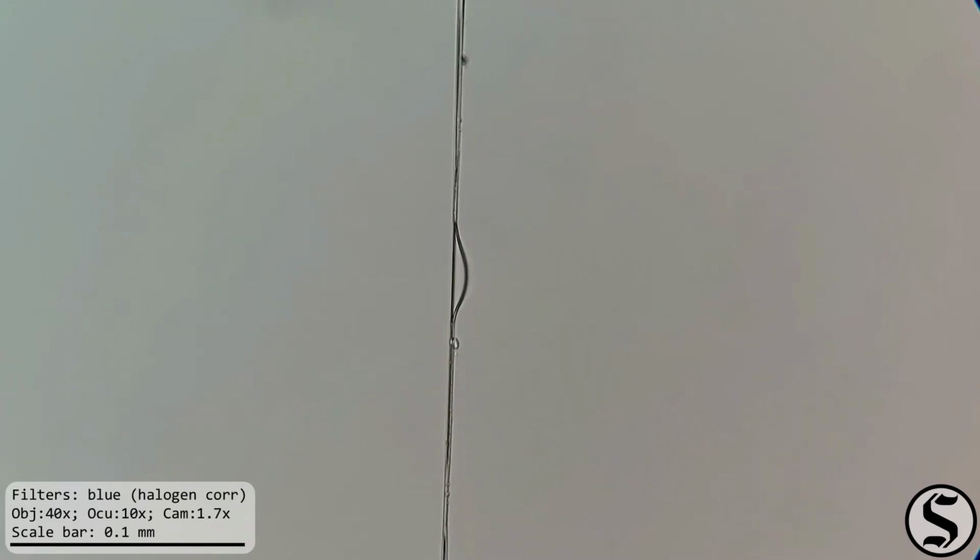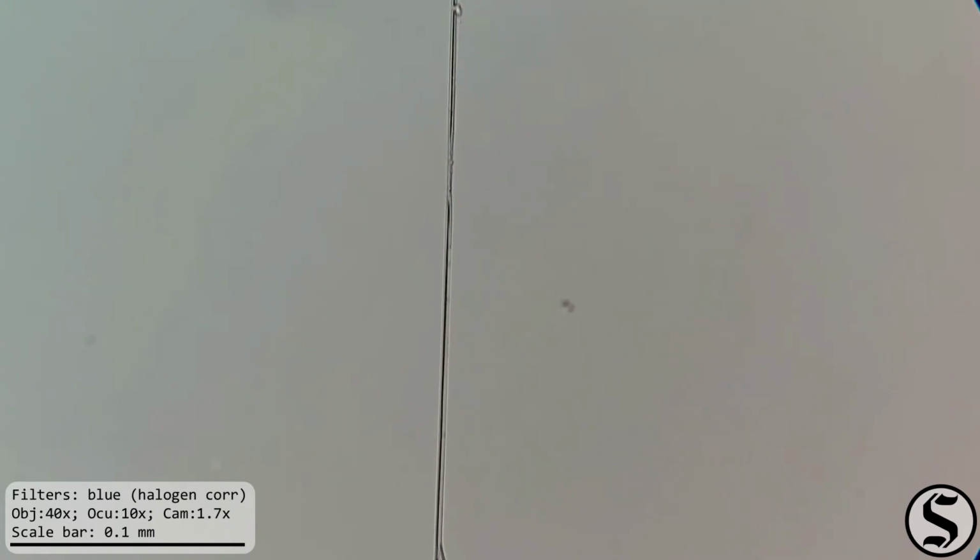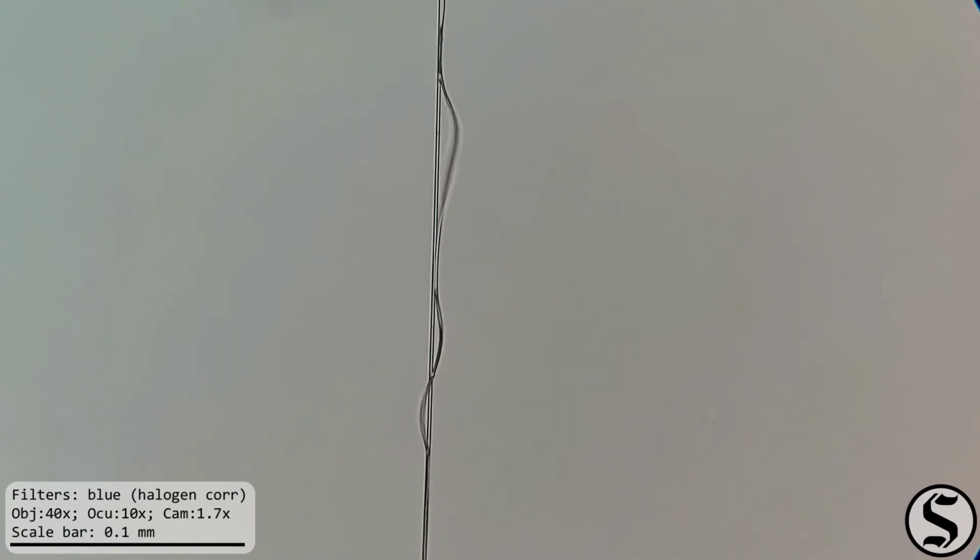I can think of two reasons right off the top of my head why you might want that. One could be to change the shape of the stress-strain curve. You know, as the thread gets stretched, it's gonna stretch in a certain way until those bunches straighten out, and then it's gonna have a different resistance to that. And then maybe the other possibility is if a straight section gets stretched too much and it breaks, then the line goes a bit slack without completely coming apart. Or, you know, maybe the spiders think that both of those are desirable properties. Not quite sure.